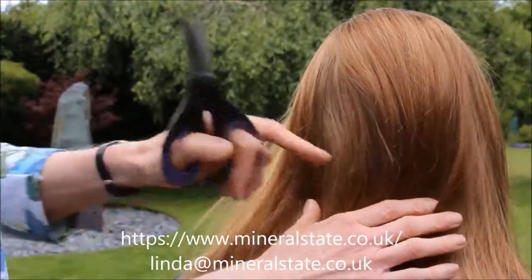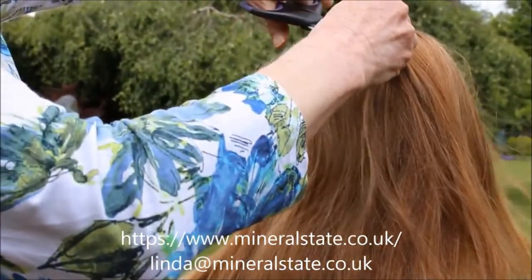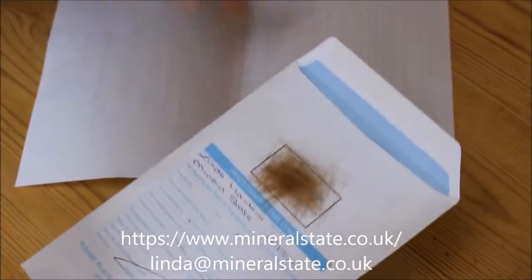What we do is we take the hair from this area here, cut the hair as near to the scalp as you can. When you've taken enough hair to cover the box, you then want to get it in the envelope.